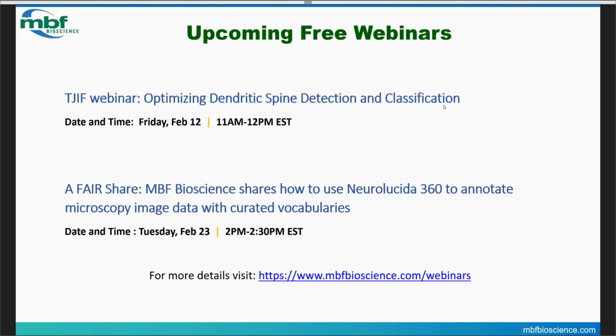You'd have to go through and just try them. It's fairly flexible, which is somewhat surprising because the brightness of the cortex, and the difference between white matter and gray matter in the two-photon, is very different from what we see in Nissl. Yet the program that Brian's written does a pretty good job of accommodating those differences.